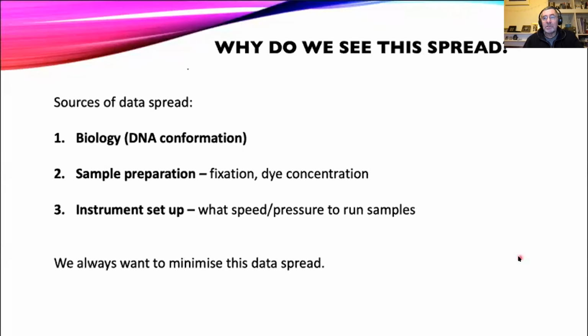So the first thing we can start thinking about is how we're going to prepare our cells. Remember, a flow cytometer is a single cell analysis instrument.